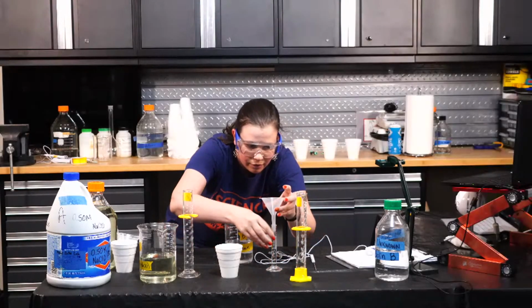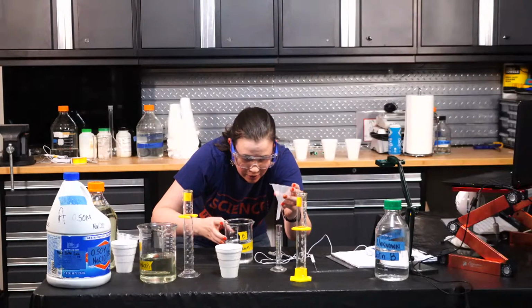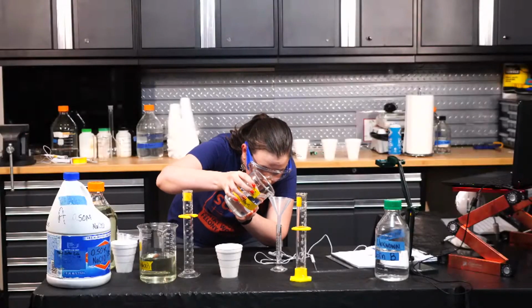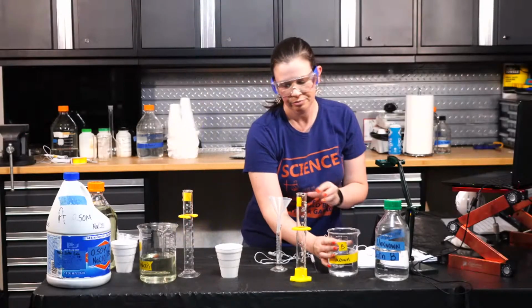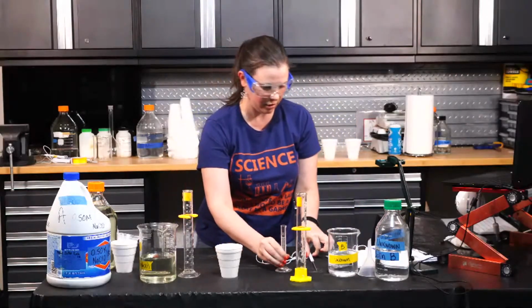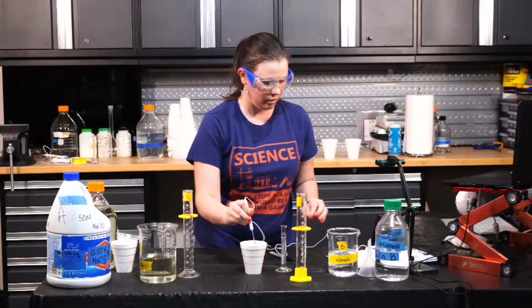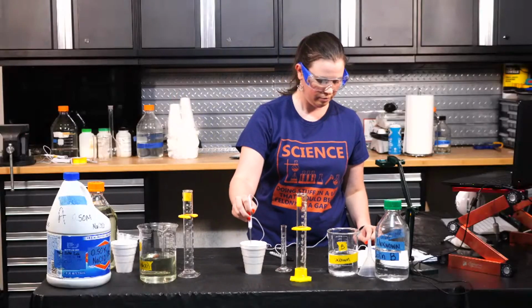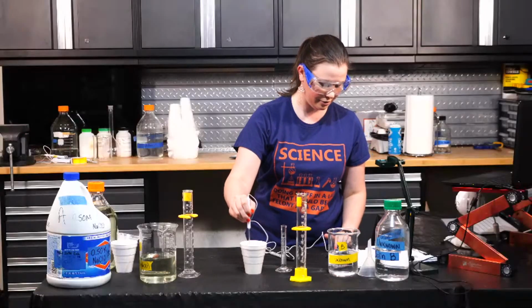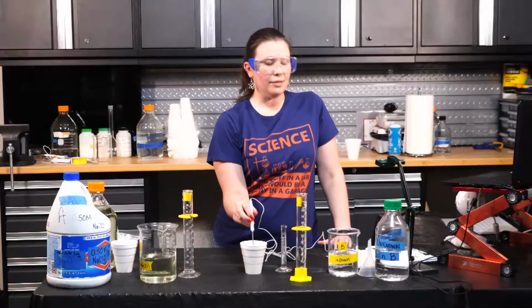Well, I went a little bit over. Let's try that again. All right. So now I got 5 milliliters in. Let's get our baseline temperature ready. All right. Unfortunately, it's getting a little bit colder in here. My baseline temperature for level 5 is 18.9 degrees Celsius.